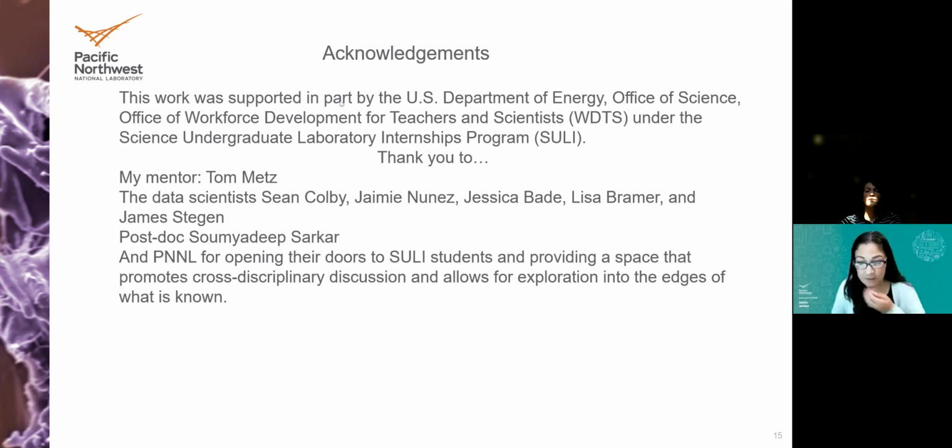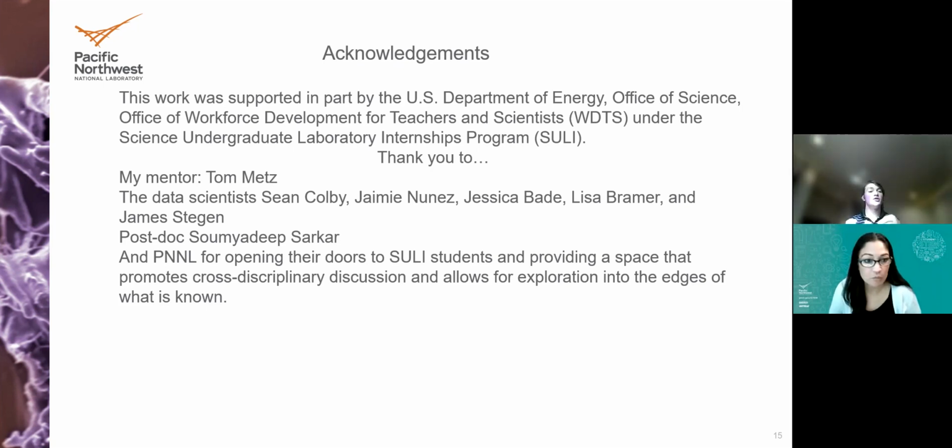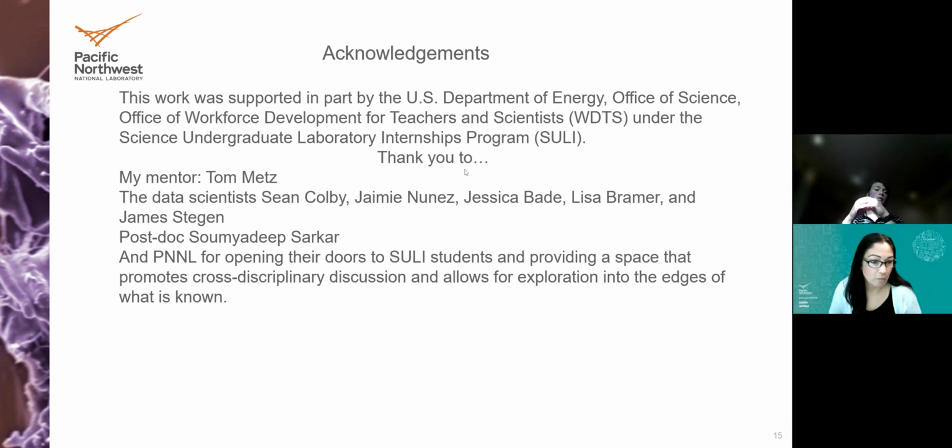What is retention time and how does that contribute to features for MS? Retention time is just, when I was discussing that 1 second elution, basically the liquid chromatography sprays directly into either the mass spectrometer or the ion mobility spectrometer. And retention time is just the time that the compounds come off.